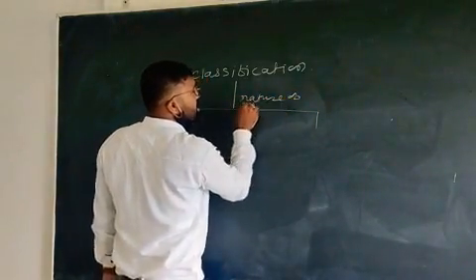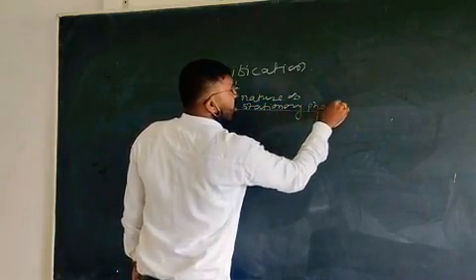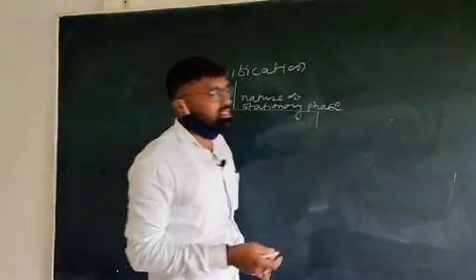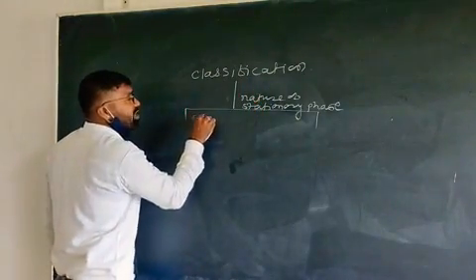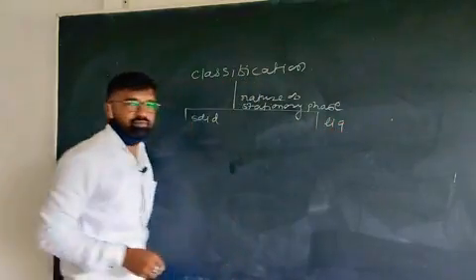We just discussed that the stationary phase is a liquid or solid in nature.